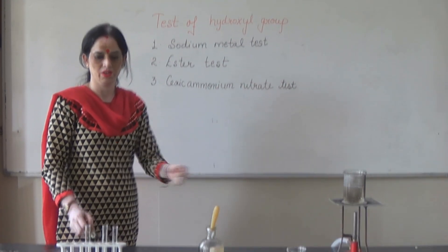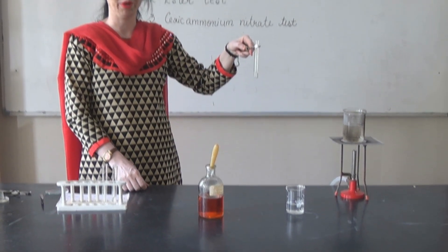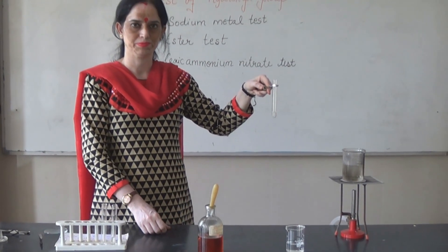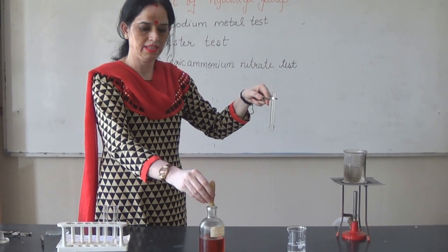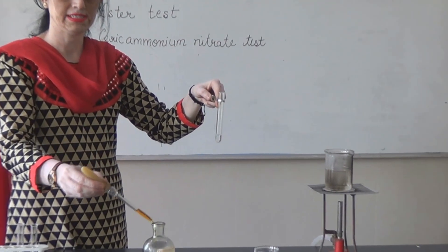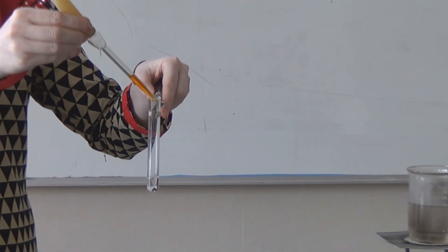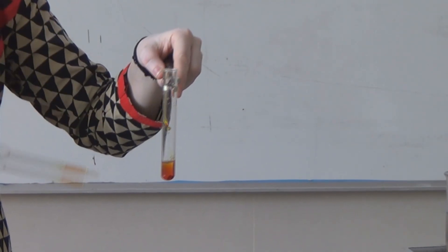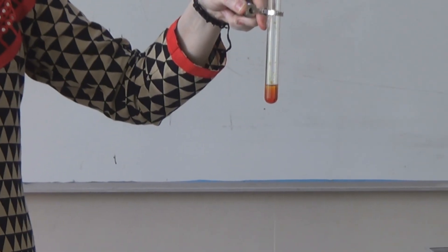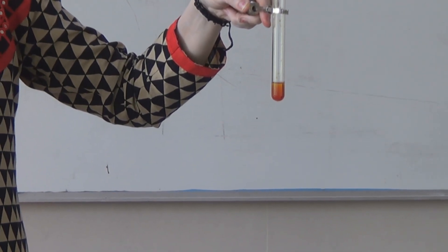In this test we require small amount of organic compound and ceric ammonium nitrate solution. In this experiment we add few drops of ceric ammonium nitrate solution to the organic compound. Formation of red coloration detects the presence of hydroxyl group in the given organic compound.